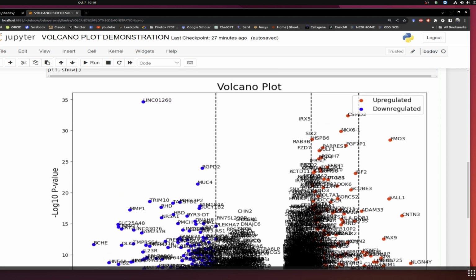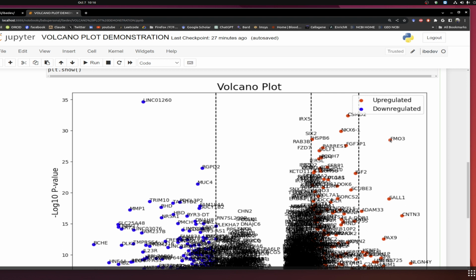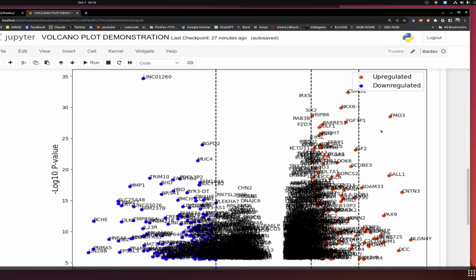The most important thing is to look at the upregulated and downregulated genes. This is the context of upregulated: for example, we have two groups, one group is control. Let's take a disease like leukemia, and those leukemic cells were given a certain treatment, and we have done the statistics, like bulk RNA-Seq, and compared the treatment group with the control. It means we want to see the changes within the treatment samples. To do so, when we have done the Wald test or the student t-test, upregulated indicates the genes that were upregulated after the treatment, and downregulated means the genes that are downregulated after the treatment.